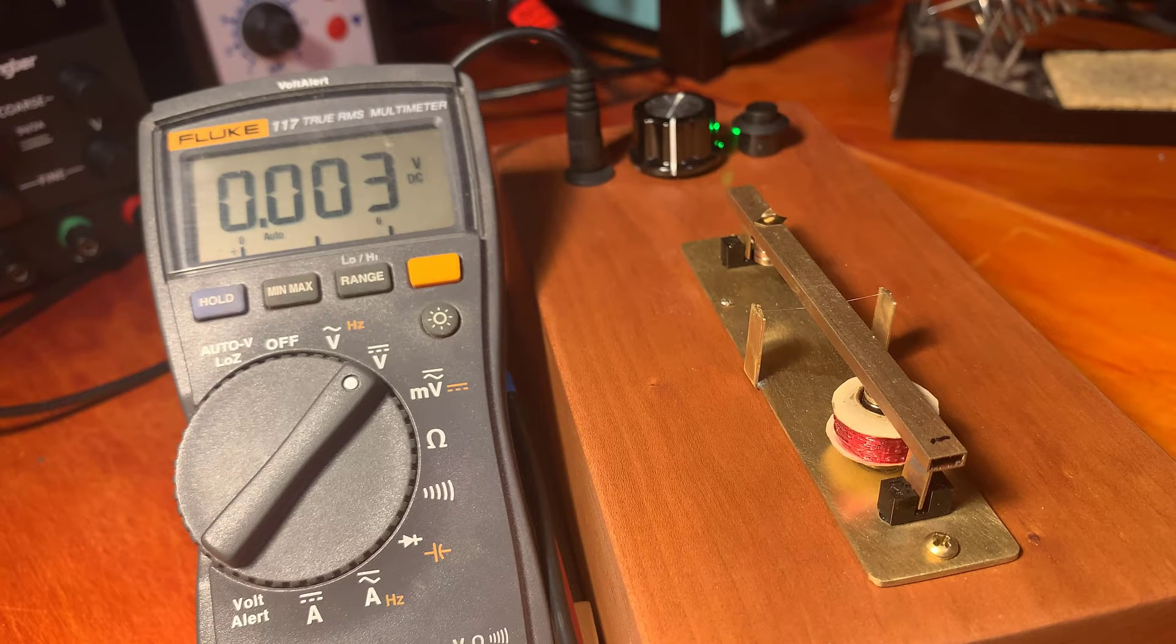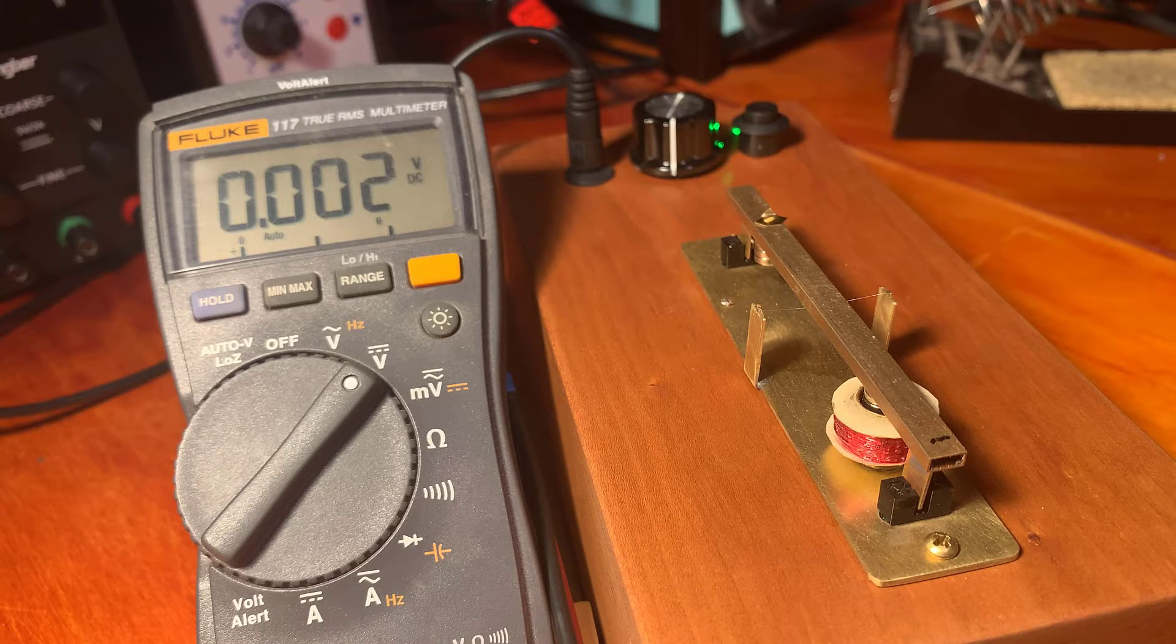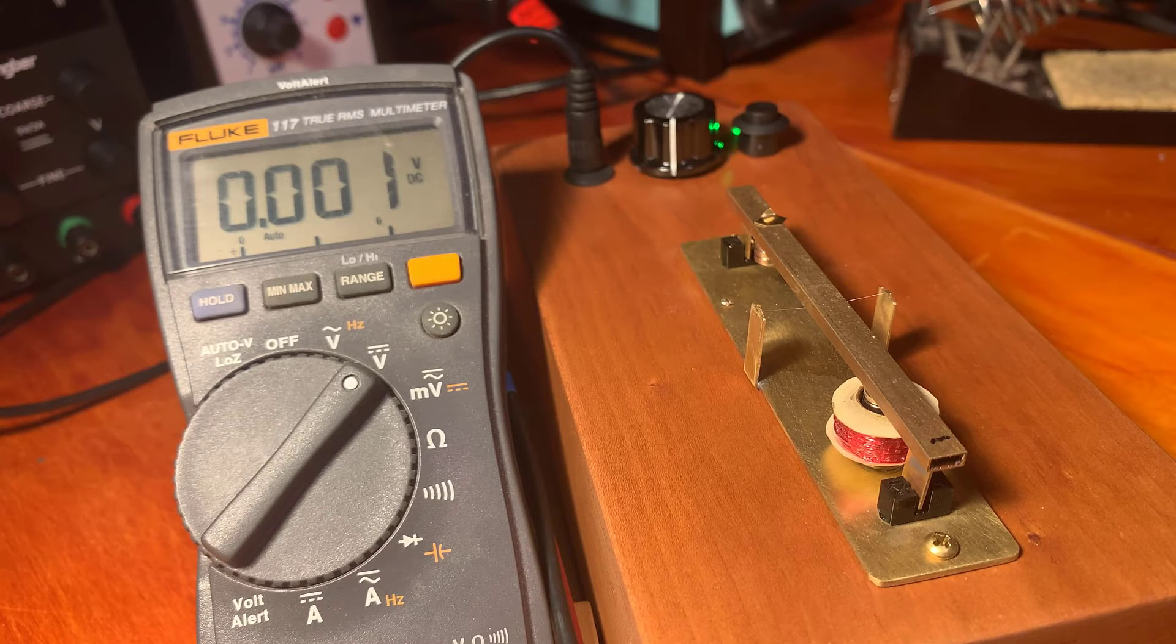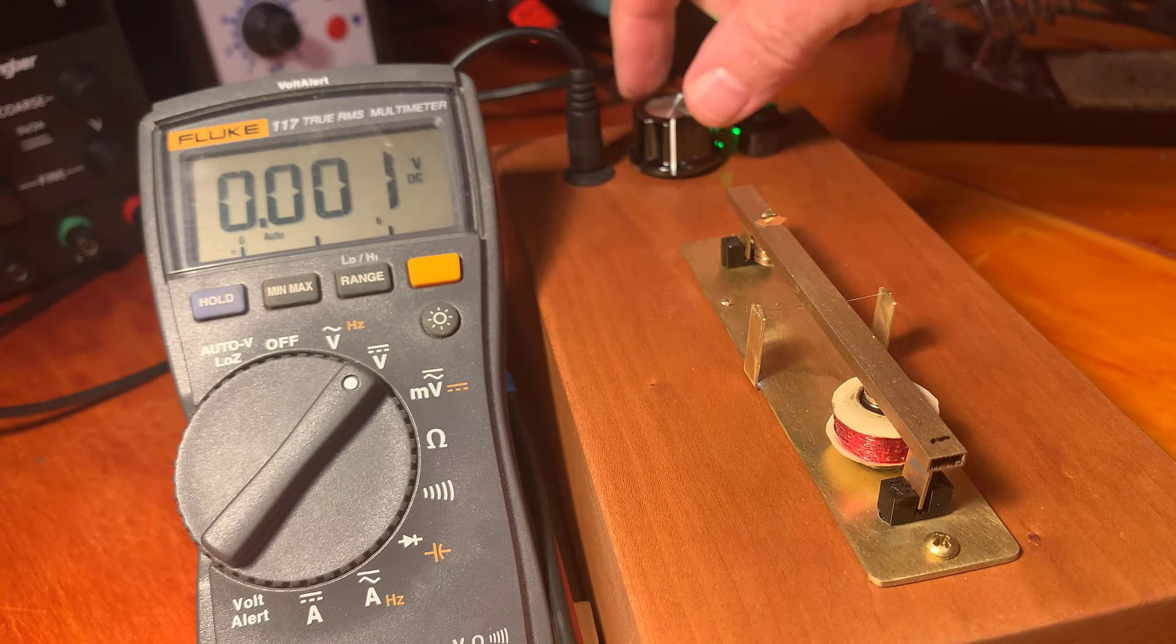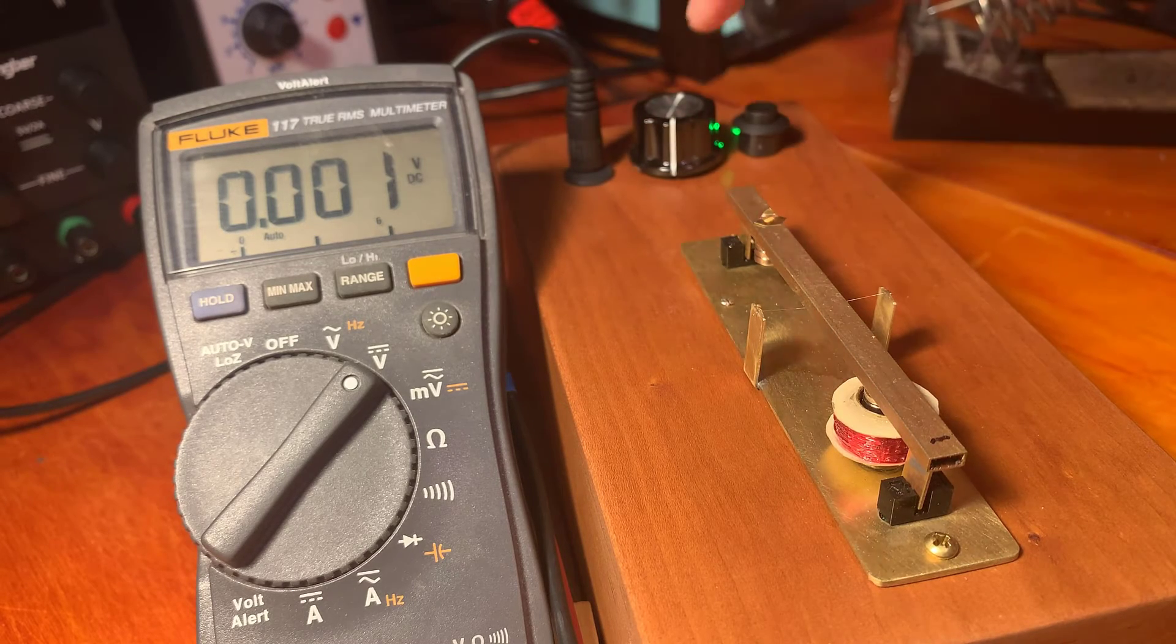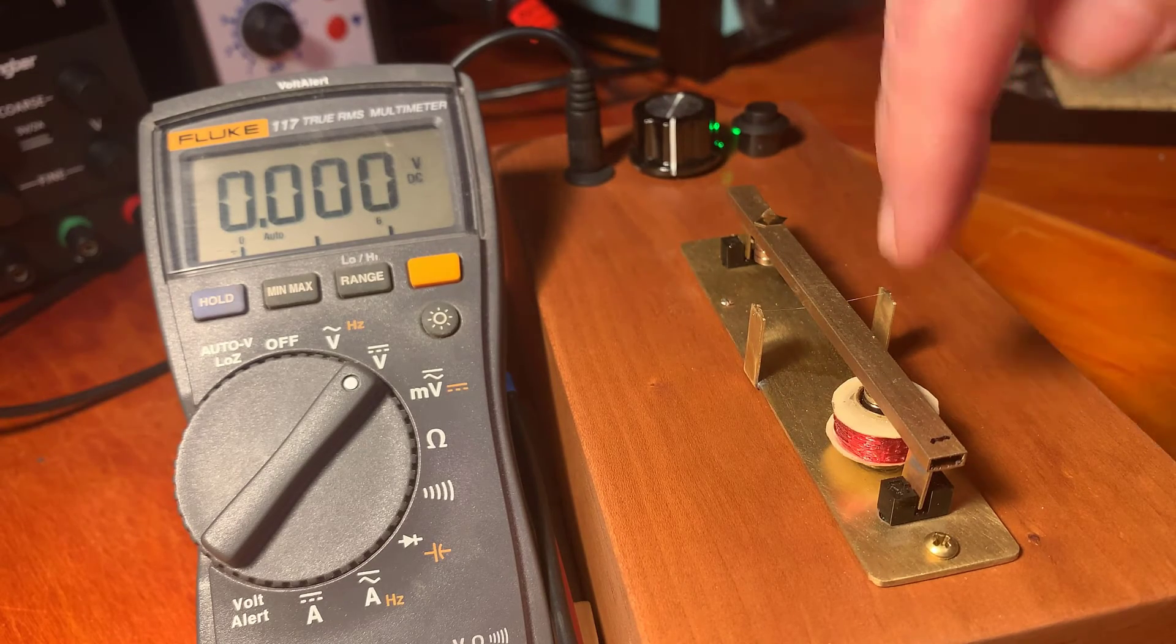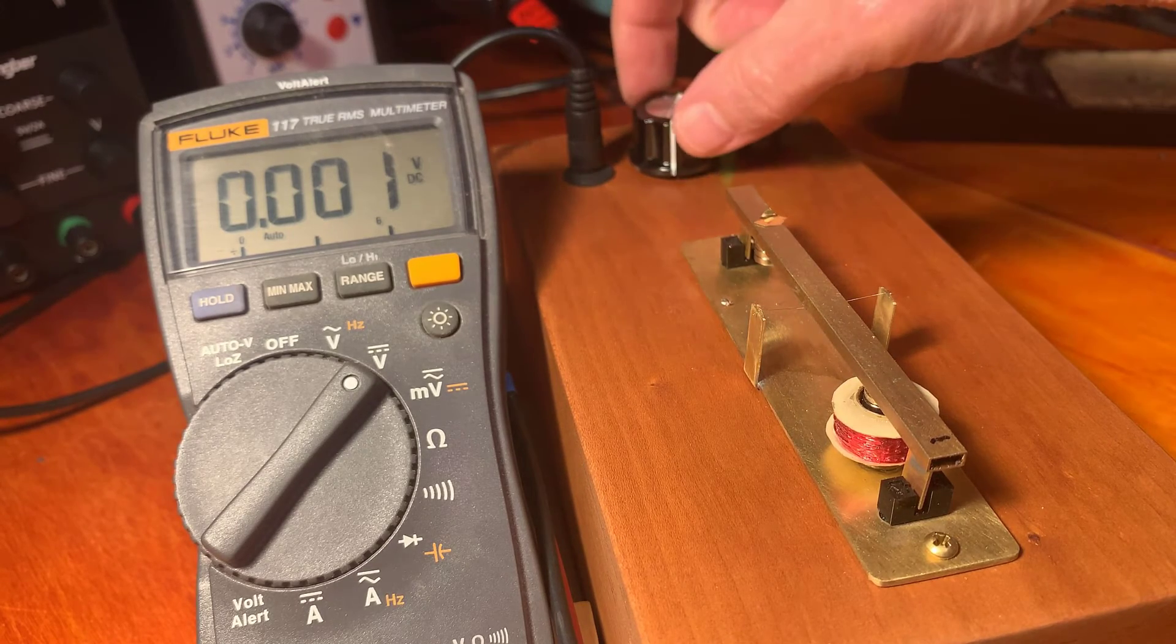I got pretty close there. My goodness. And then I can electronically zero it by turning this knob. This just puts a little bit of static current into the coil itself.